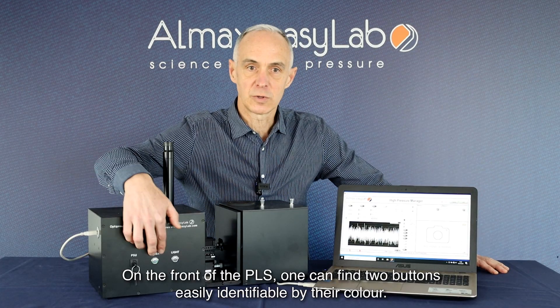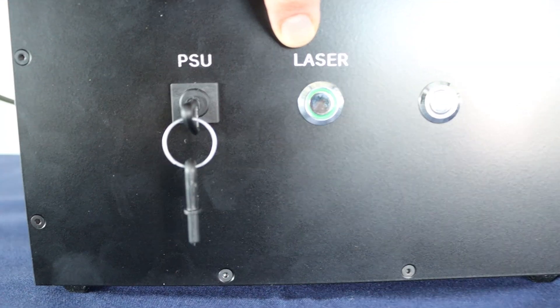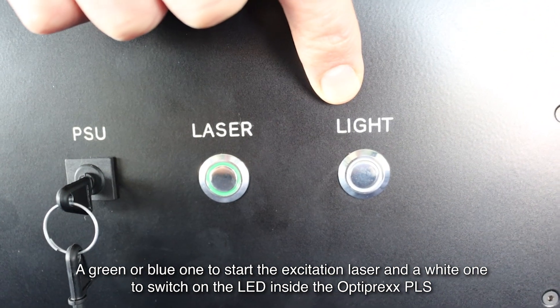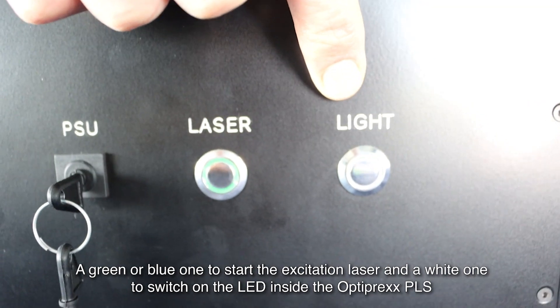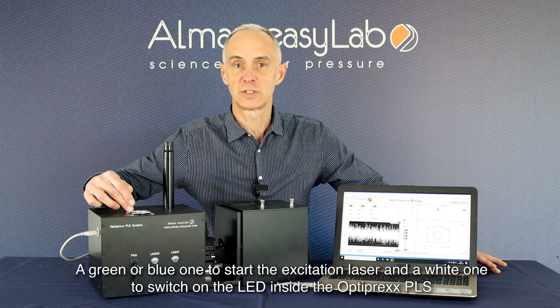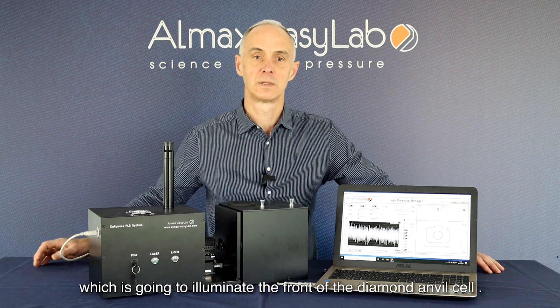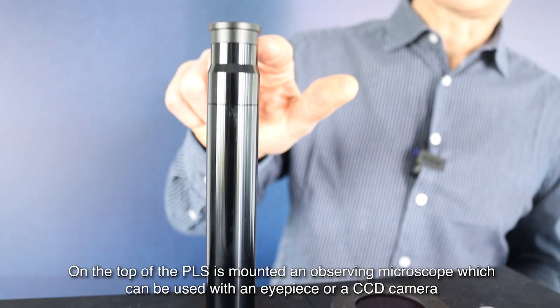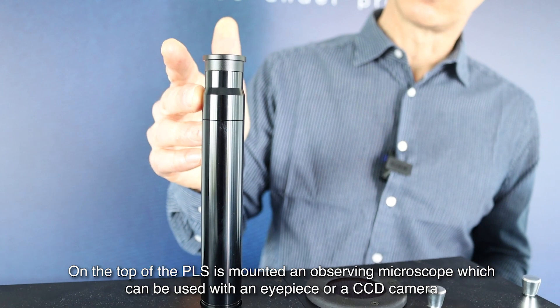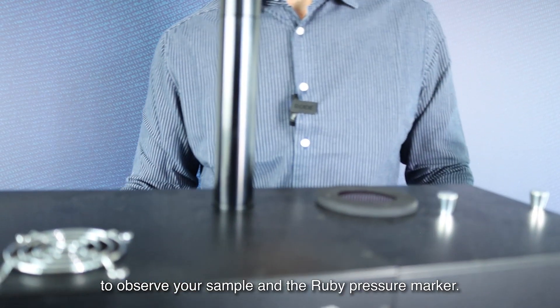In front of the PLS, one can find two buttons easily identified by their color: a green or blue one to start the excitation laser, depending on whether it's a green or blue laser, and a white one to switch on the LED inside the Optiprex PLS, which is going to illuminate the front of your diamond anvil cell. On the top of the PLS is mounted an observing microscope, which can be used either with an eyepiece or a CCD camera to observe your sample and the ruby pressure marker.